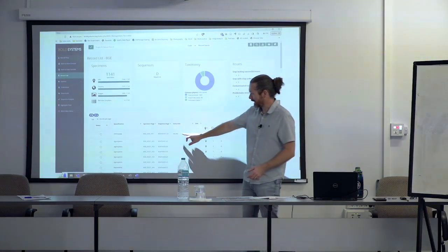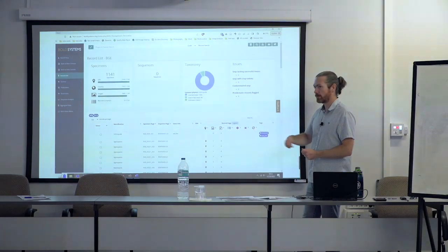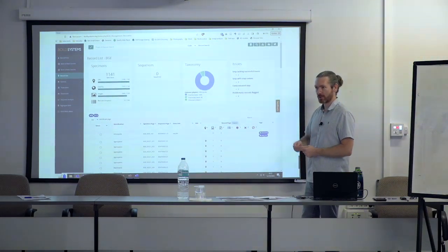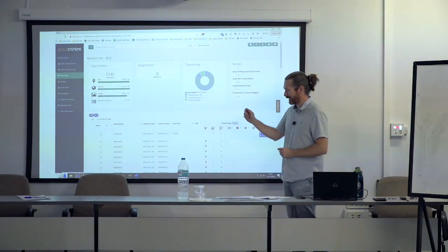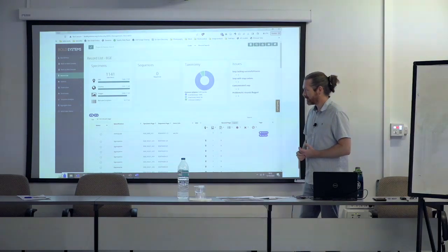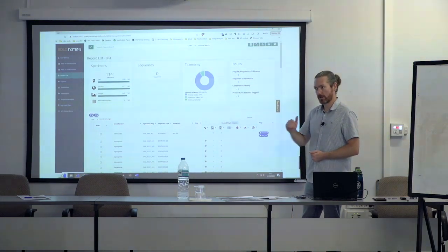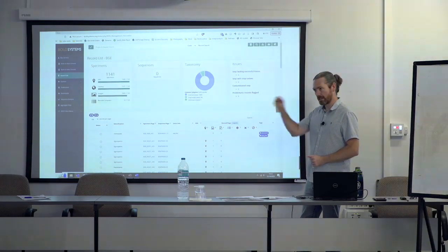This extra info actually does go into the public record here. And it could be updated in batch by the sequencing centers. So unless Rutger comes up with a smarter solution, we'll probably end up doing something like that, and then on all the records, it'll tell you what status that record is in the pipeline. Yeah. Fabian, who's our Perl whiz, would be able to then script pulling that up and summarizing it, which is quite cool.